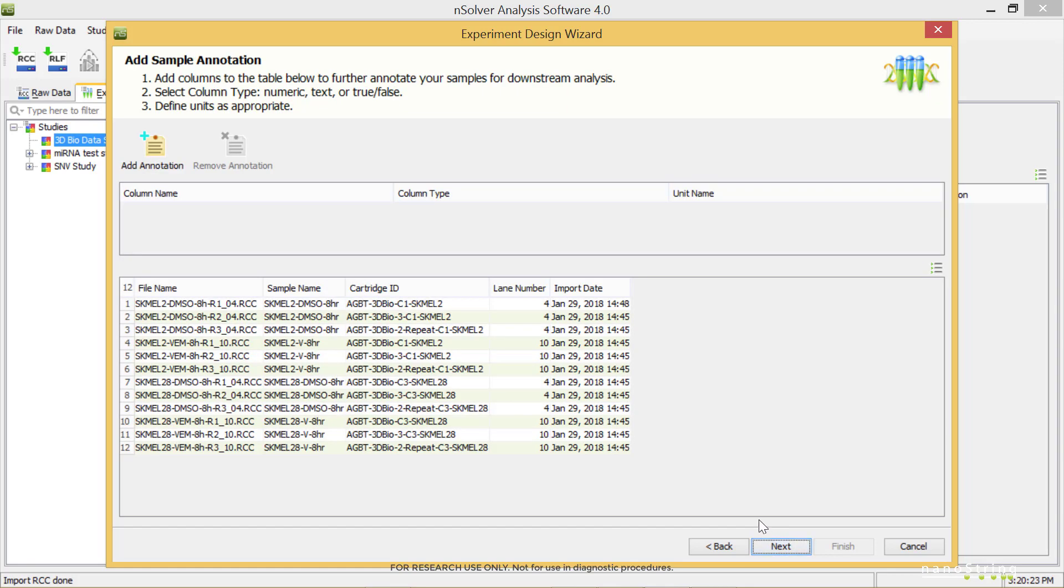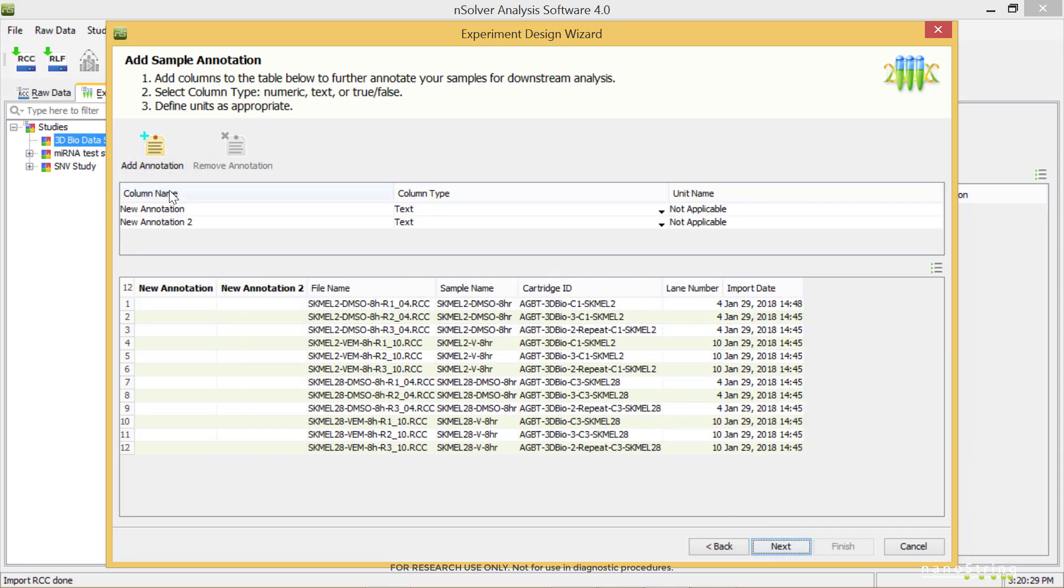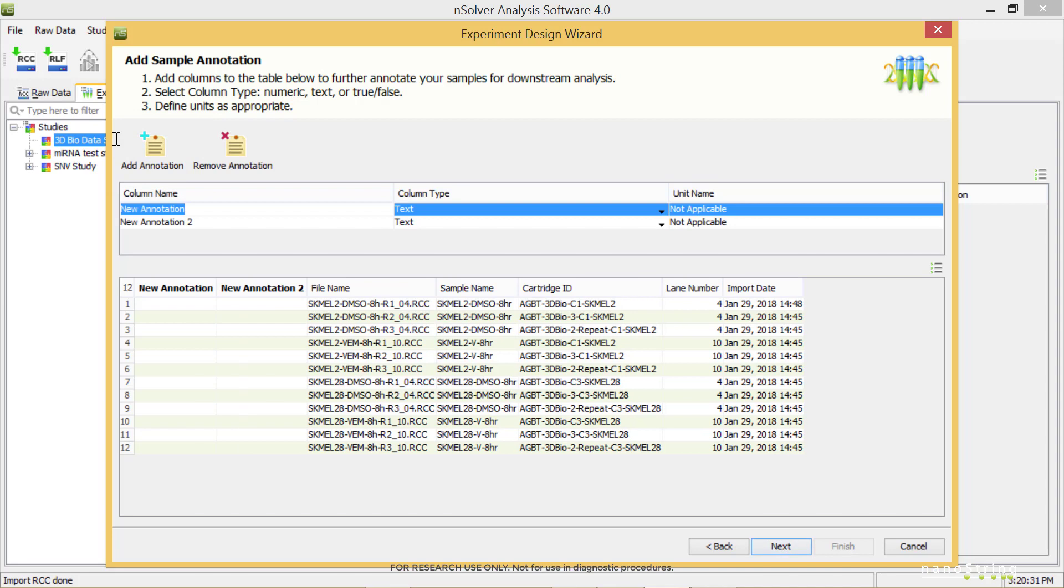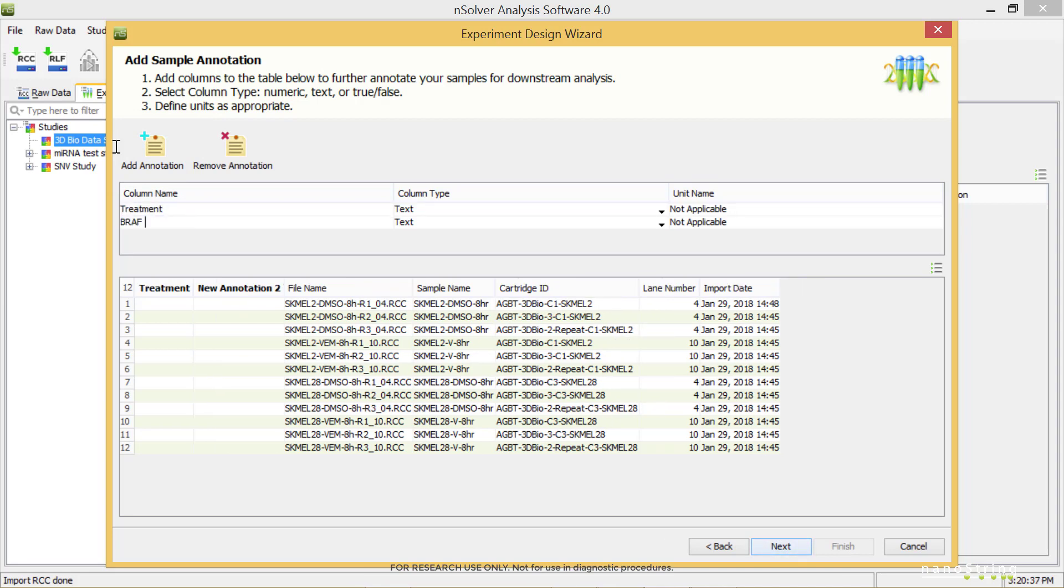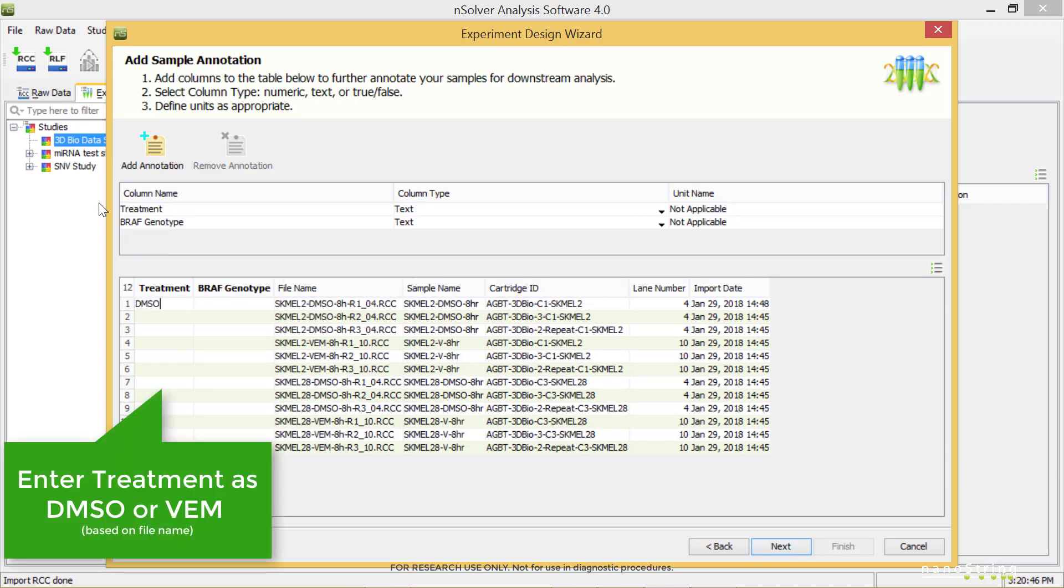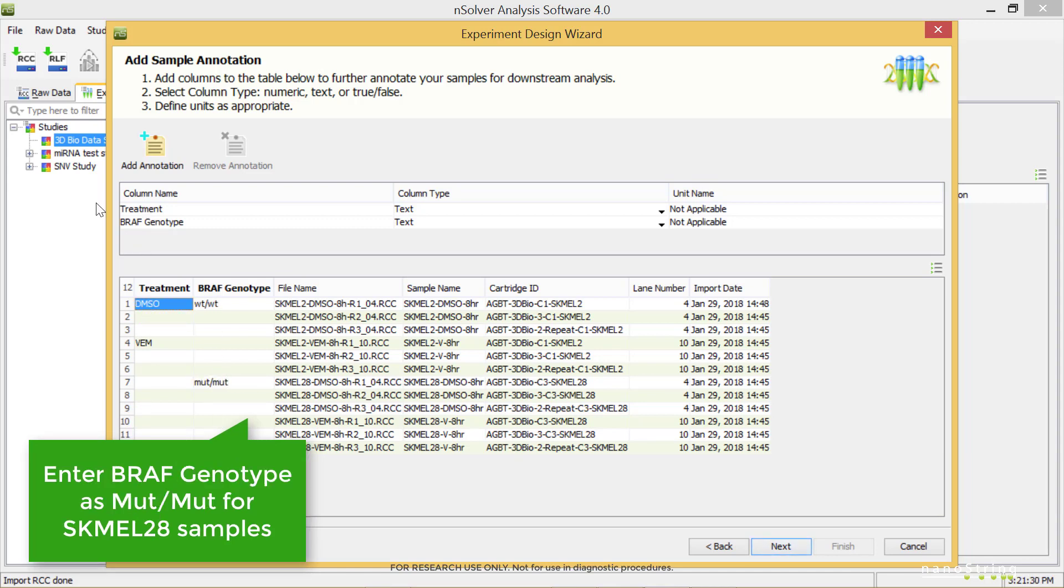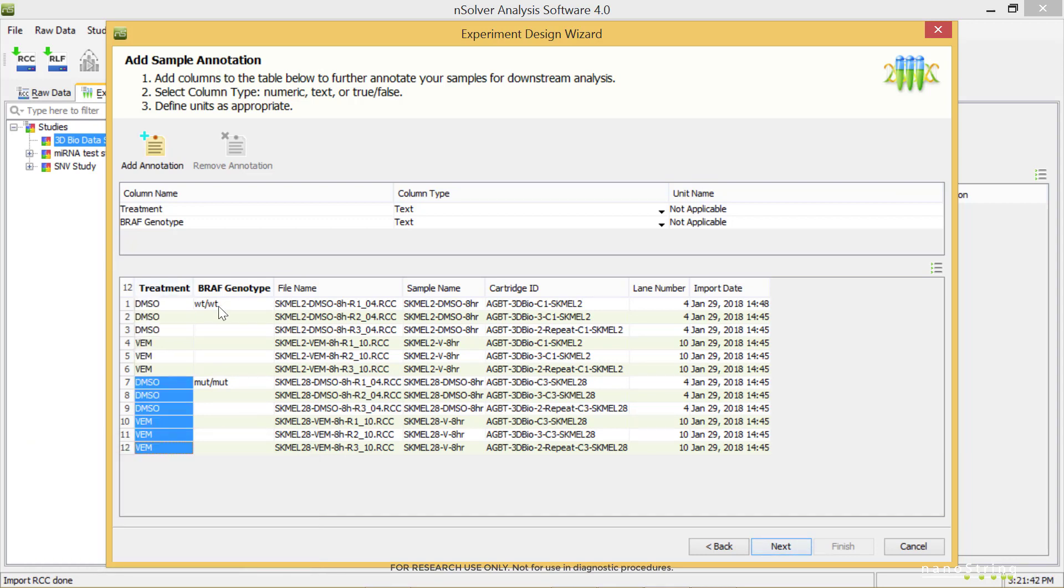We'll create annotations now. Create two annotation categories by selecting Add Annotation twice. Change New Annotation to Treatment, and New Annotation 2 to BRAF Genotype. Add the specific annotations under the New column. We'll add DMSO or VEM for Treatment, and Wild Type Wild Type for SKMEL2 samples, or Mutant Mutant for SKMEL28 samples under BRAF Genotype. Select Next.